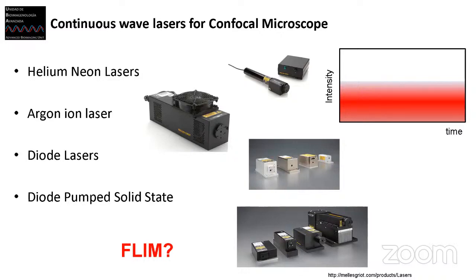So you have more or less an average amount of light, and you have some other optical tools in order to attenuate light for the imaging. But the output of our lasers is always more or less in the same range. And these can be gas or more modern solid state lasers that can have many, many bands. Most of these are discrete, so we have a single wavelength. And in all these cases, as I mentioned, this is basically a continuous wave.